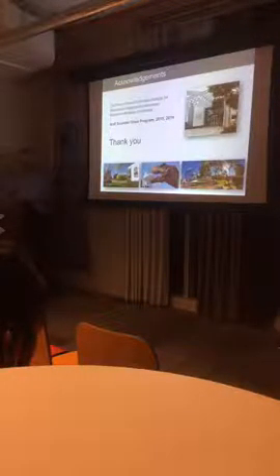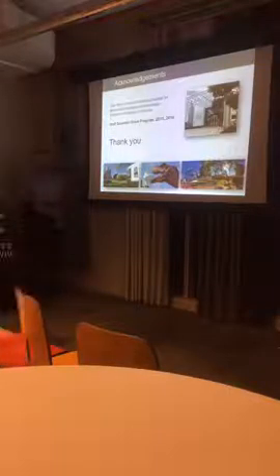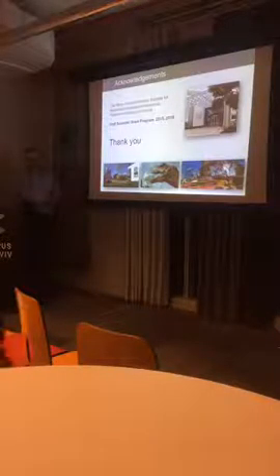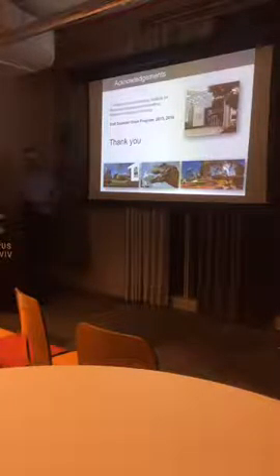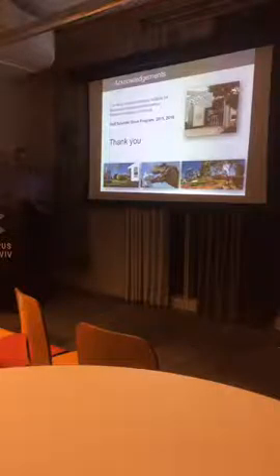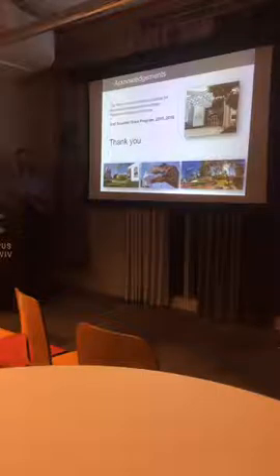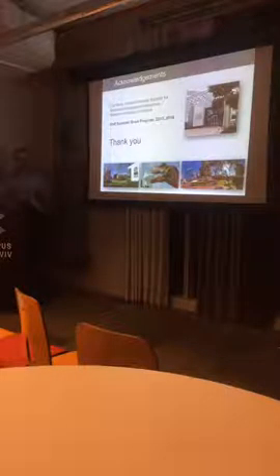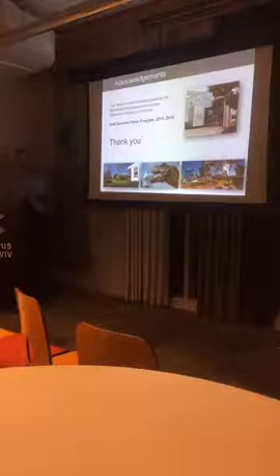We have a question online. Eshel is asking, can you think of a pathology that home users could diagnose using a small chip device or phone camera modification? Yes, absolutely. There is one group in Ben Gurion that I know that tries to use a cell phone and a laser, and also at SPIE Photonics West there are now maybe 10 groups trying to do it.